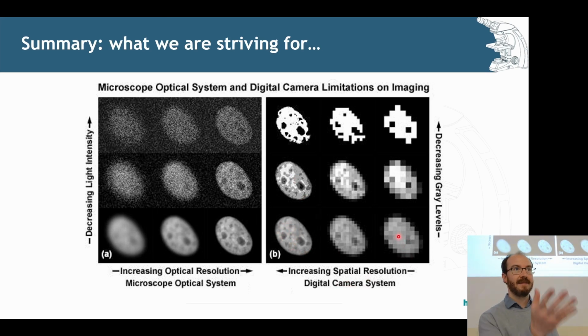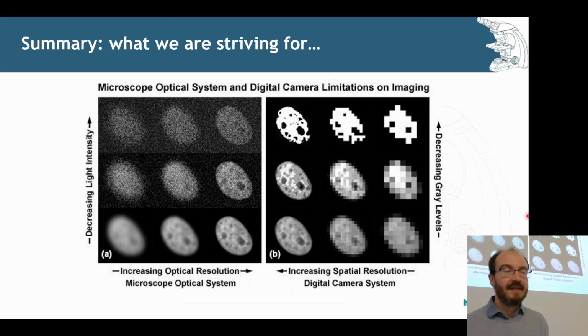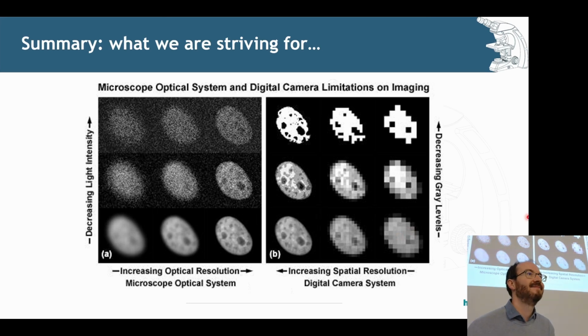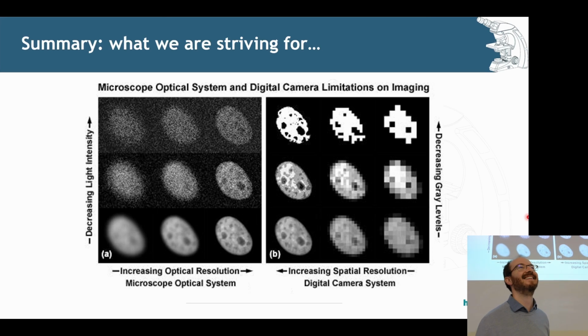Yes? Sometimes you can't increase the intensity. So what you mentioned is like you have 3 or 4 intensity levels out of 10. If we struggle with low intensity samples, would it be better then to go for a higher bit depth, so that even though we're working in that low range, we at least have 100 or 200?